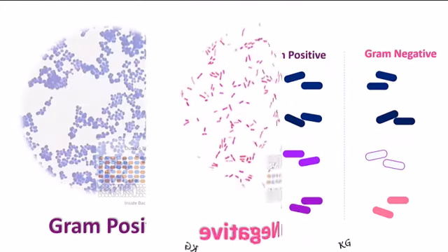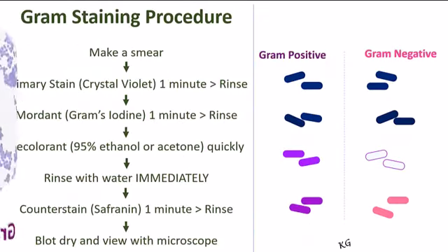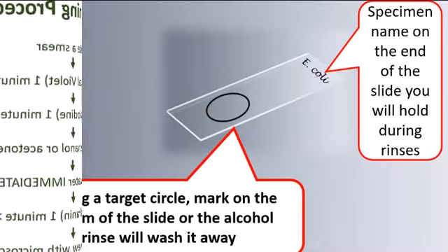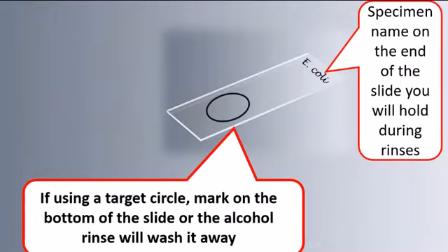For a gram stain, you will want to start with a young culture — about 18 to 24 hours old works best. Older cultures, especially gram-positive bacillus, will sometimes give inaccurate results. If you'd like to draw a target circle on your slides for applying the bacteria, it will need to be done in wax pencil or with a permanent marker on the underside of the slide, because we'll be using an ethanol rinse during this procedure.